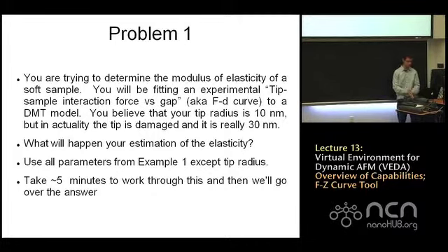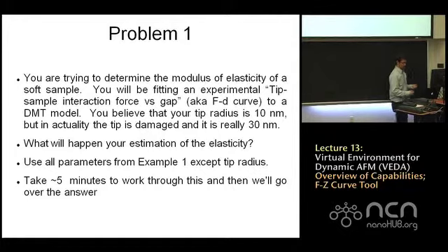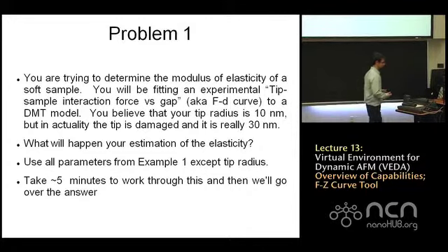Okay, so in this first problem, let's say you're trying to determine the elastic modulus of a soft sample. The way we'll do this, which I think you probably covered on Tuesday, is to fit the curve to a model. So you do some sort of nonlinear fit and you'll get a parameter, assuming a model, from a measured force distance curve.